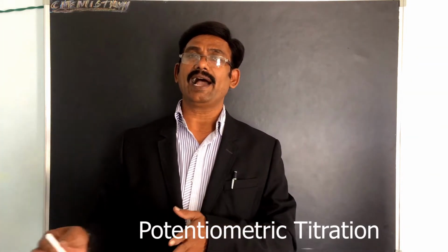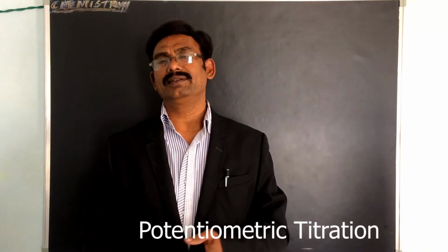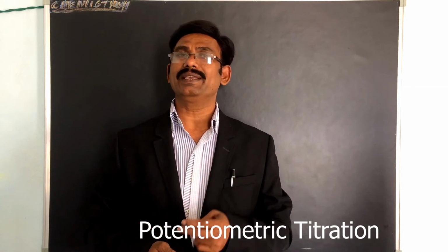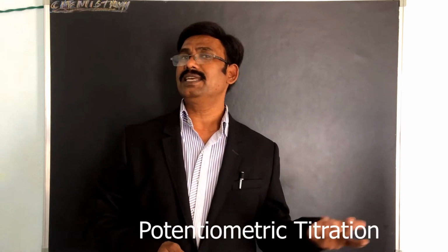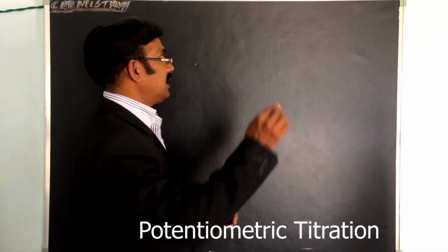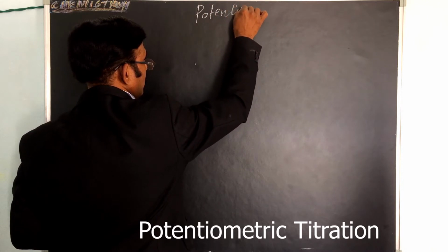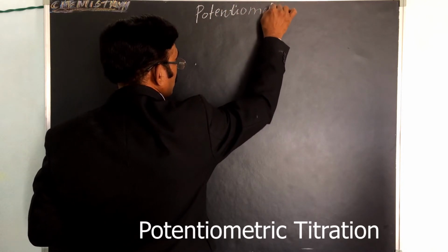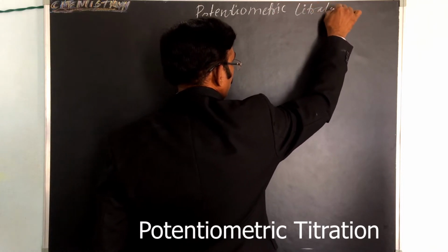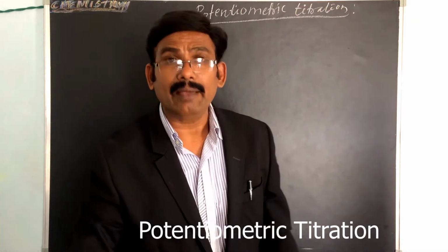This is very useful in the lab. We have 2-3 experiments based on this potentiometric titration, so this is very important. In both cases, this topic is useful in the lab as well as in the theory exam. Okay, so what is the topic? The potentiometric titration. This is the topic I am going to explain.